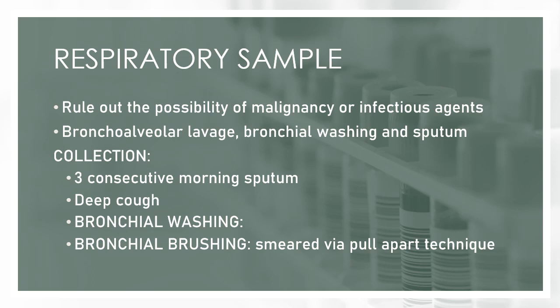You have your bronchoalveolar lavage, your bronchial washing, and your sputum. Usually the most common is, of course, your sputum. For the collection of your sputum, you need three consecutive morning samples.